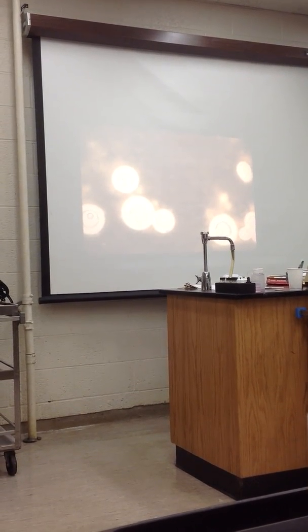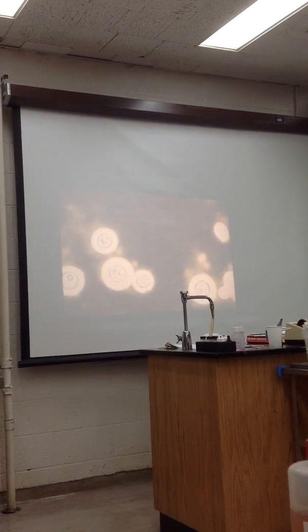Cryptococcus neoformans, spinal fluid, with the black background. You see, taking a picture of it and then recording it. How quick is it if you draw it and name it and then look at it? Which one is faster? Stop wasting yourself. Do both. Indian ink. Now you take the spinal fluid, you mix it with some Indian ink on the slide, put a cover slip on it, and that's what you see.